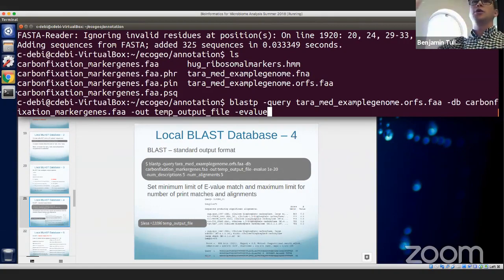And so if you have a really good stretch of gene homology, and it gets a really high score, you can have a lower value. In this situation, where we only have 325 proteins that we're searching against, a match or a stretch of a match might be enough to trigger a response because it's making these comparisons between all of the results. So what we want to do here is actually use a much smaller cutoff value, 1e to the negative 20th, right? This is saying we don't really want all these little tiny matches between these proteins, only find us a statistically good long match for this limited amount of data that we have.